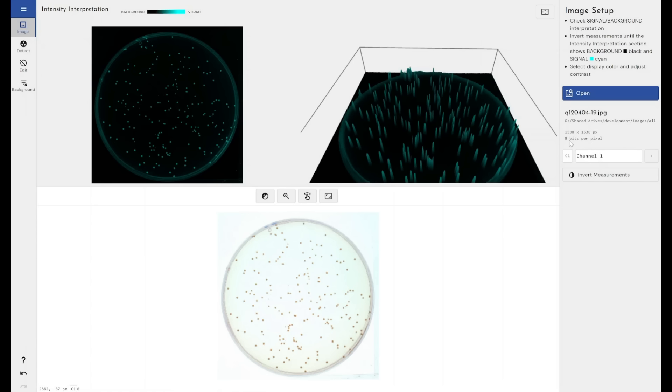We would always recommend at least using a TIFF image, an uncompressed image with at least 16 bits per pixel. That's very much the industry standard. Any modern camera that's fitted to a microscope or scanner or gel documentation device will support TIFF at 16 bit export.